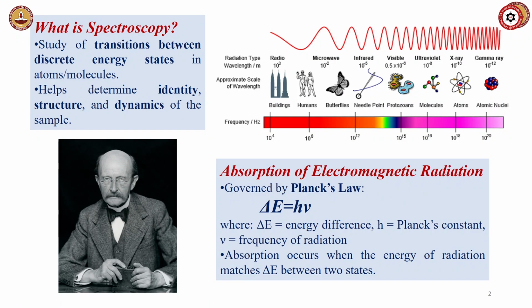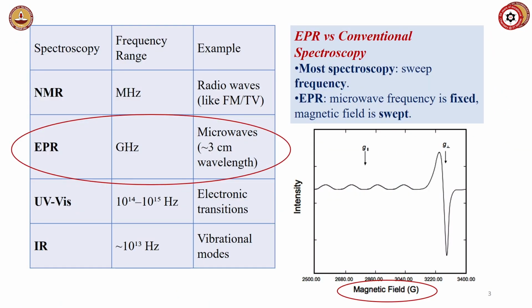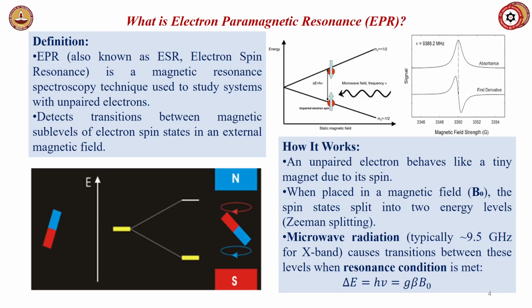So now for EPR spectroscopy, this is the copper EPR. These are the 4 lines I was talking about because of the 3/2 spin, and this is g parallel and g perpendicular. And this is the Gaussian first derivative, as you all know, with spin up and down.